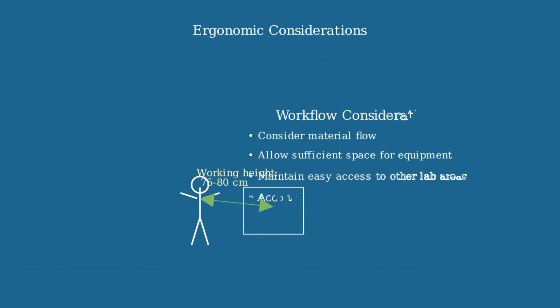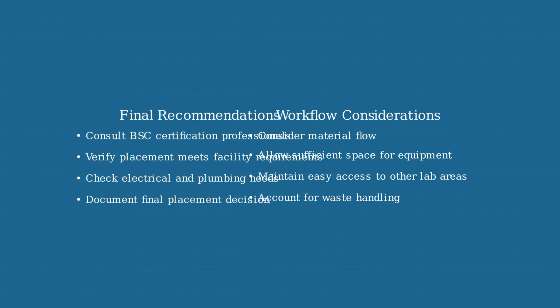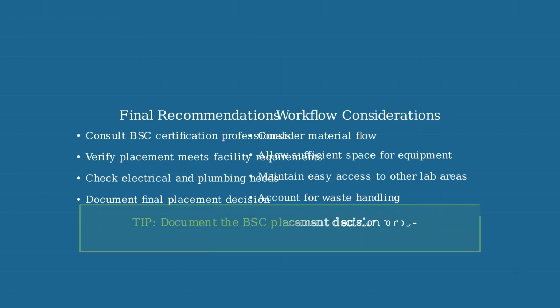Workflow considerations are equally important. The BSC should be positioned to optimize material flow, provide sufficient space for equipment, and allow easy access to other laboratory areas. Before finalizing BSC placement, consult with certification professionals, verify that the placement meets facility requirements, and check that electrical and plumbing needs can be accommodated. As a best practice, document your BSC placement decision process for future reference and to facilitate certification.